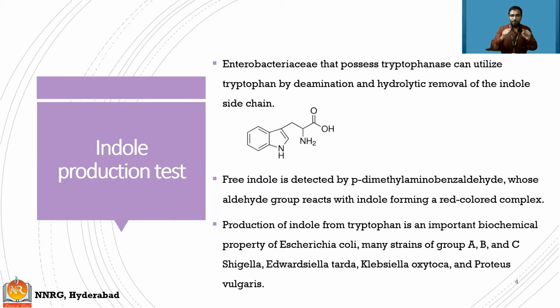Okay, to the benzene ring which has an aldehyde at the top. At the bottom it will have an amino group, an N group. It is saying dimethyl, so nitrogen will have two methyl groups. So: benzene ring, bottom N with two methyl groups, and at the top CHO, that is the aldehyde. So it will be para-dimethylaminobenzaldehyde.